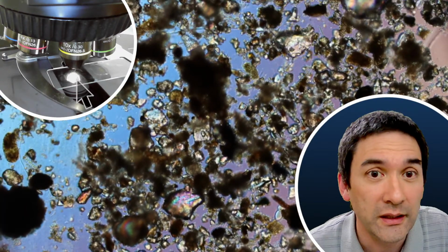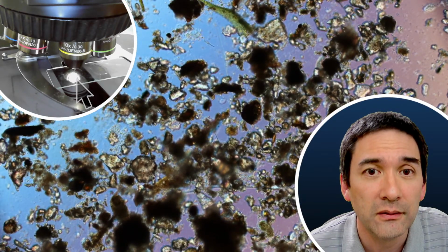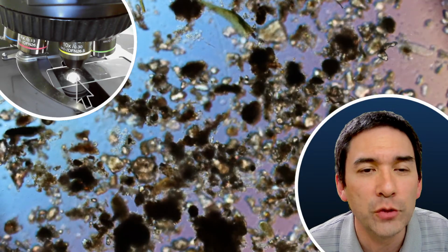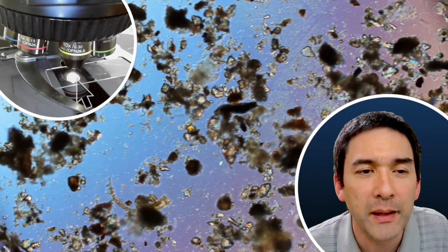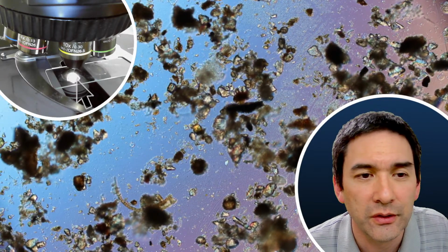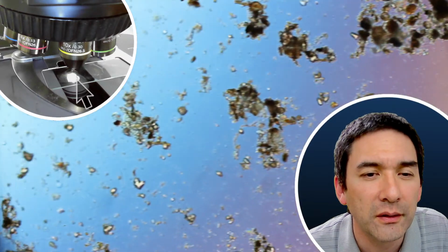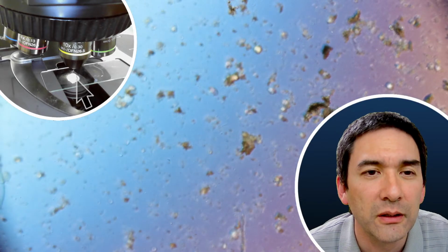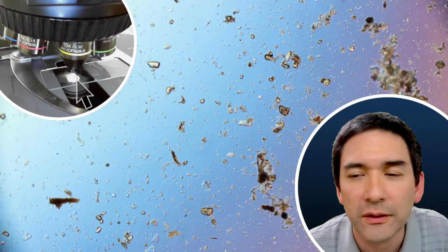I'm really getting a little bit upset now that I'm not able to find any. The megapixels are really not so much of an issue, because usually the cameras have many more megapixels than what the microscope is able to resolve. Generally, there are quite a few of them. So maybe I'm just going to go off to the side here a little bit, and maybe I'm going to try to find something over there as well.